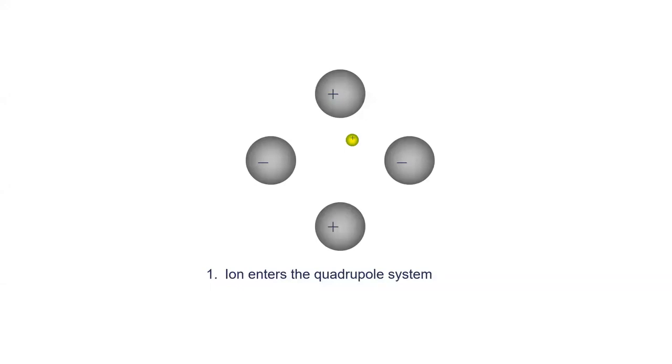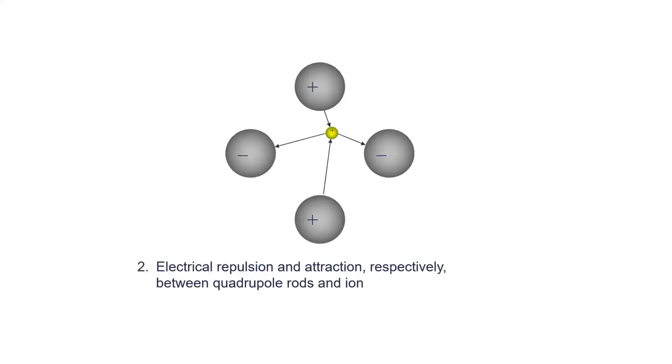Ions we can maneuver this way, but if we have a neutral particle, of course we can't do anything, so it will just go on, which is also nice because the detector can't detect neutral particles. So we can actually guide ions through this path and get only the ions of the mass-to-charge ratio that we're actually considering. So this is how it works.